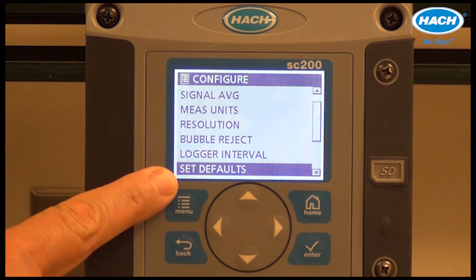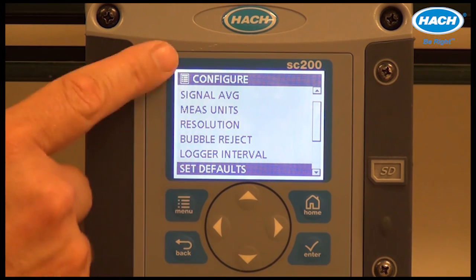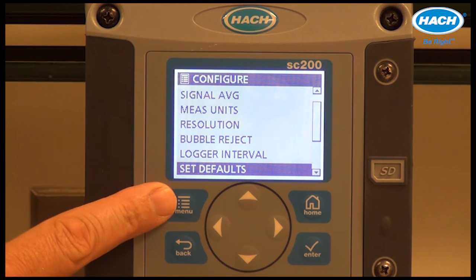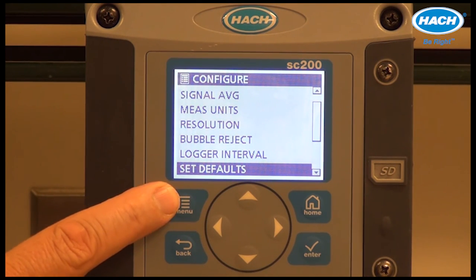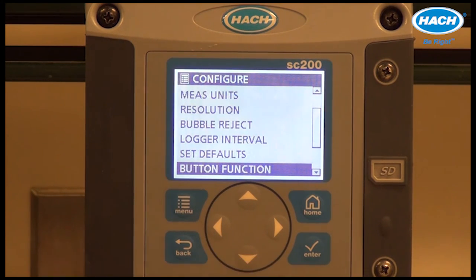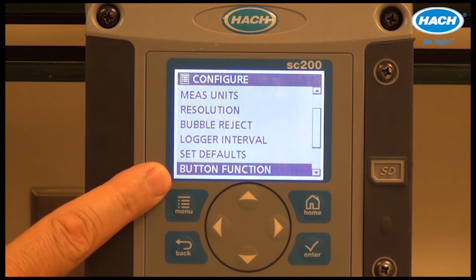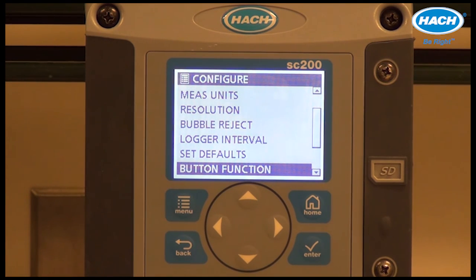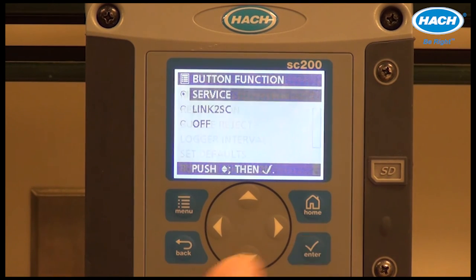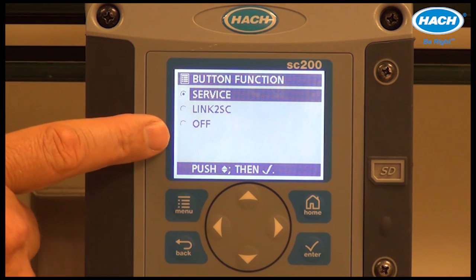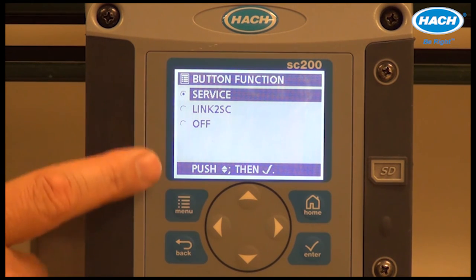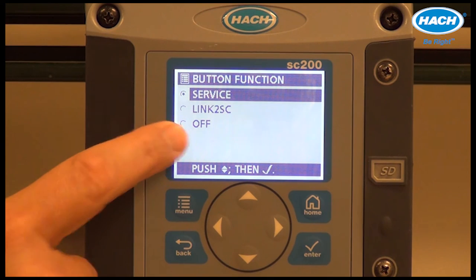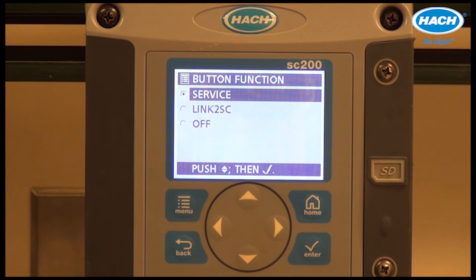Set defaults allows the user to return all configuration settings back to factory default if desired. Button function allows the user to define the function of the blue button on the front of the TU5400. Pressing enter, you can choose functions such as service, link to SC, or you can turn the button off if desired.